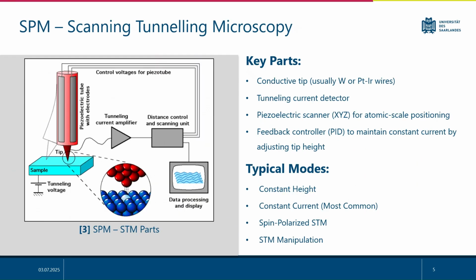Here we can look at some of STM's key components, which include a metallic tip, a current amplifier, and a PID feedback system that keeps current constant by adjusting the tip height. STM modes include constant current, constant height, and even atom manipulation in advanced setups.